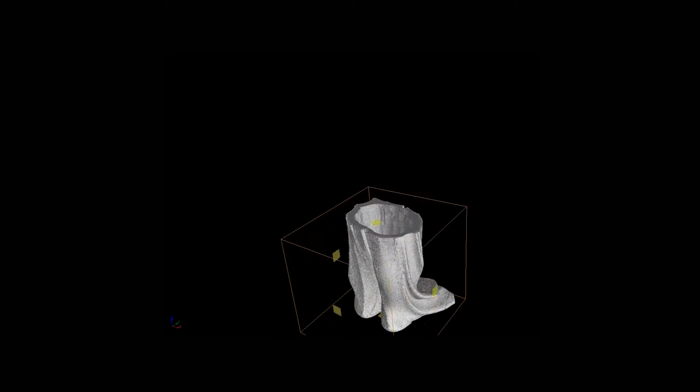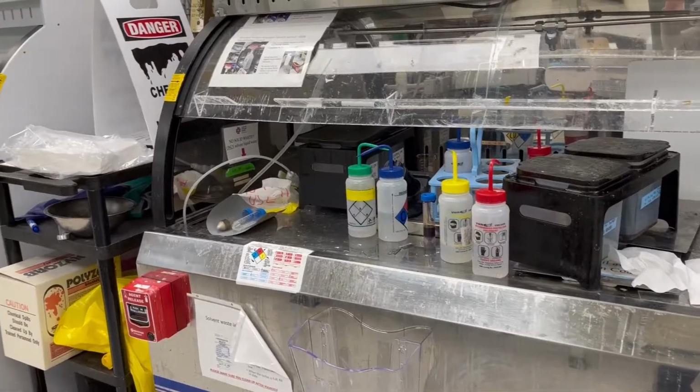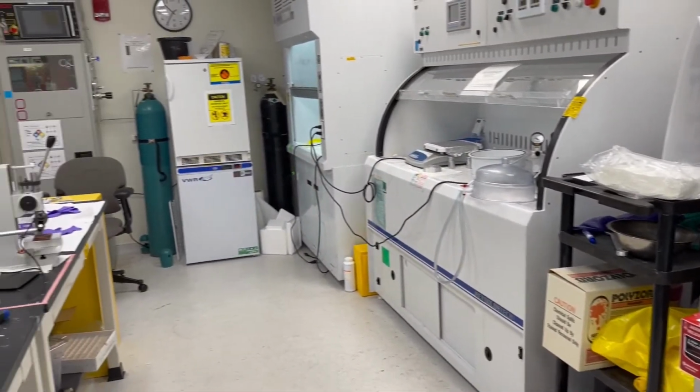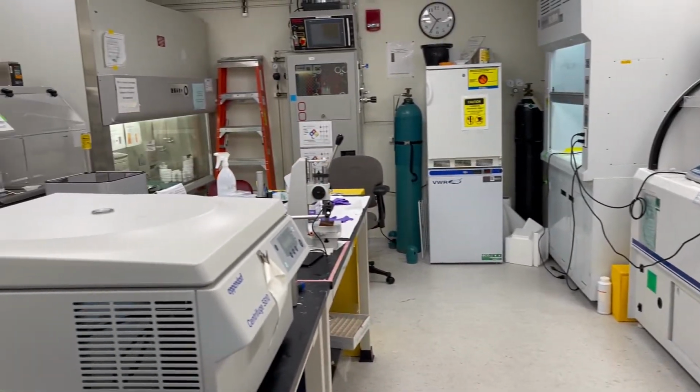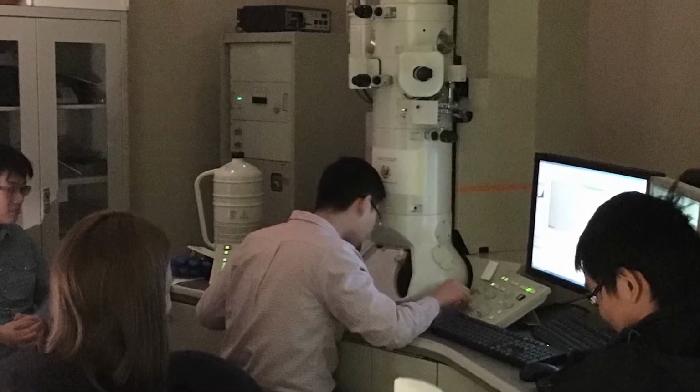Our goal is to enable characterization of hard and soft materials over several length scales from the macro scale to single atoms. We achieve this by providing equipment, training, and support over a variety of techniques, some of which are highlighted in this video.